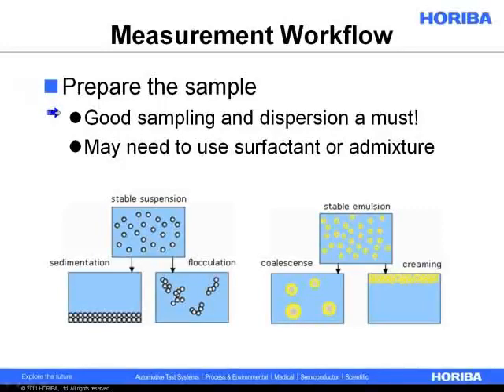We have other webinars on our website on how to attain good sampling and dispersion, but that's an absolute must. If you can't be absolutely confident that what you're putting into the analyzer is representative of the sample you have in your lab, then it's going to be a bit more difficult to trust the data that comes out of the analyzer. Sort of garbage in, garbage out, although that's a bit harsh.